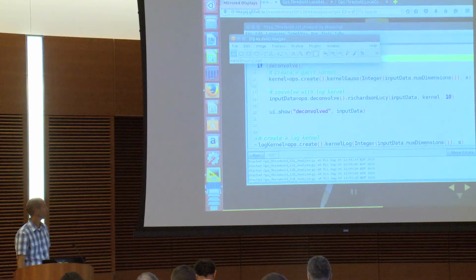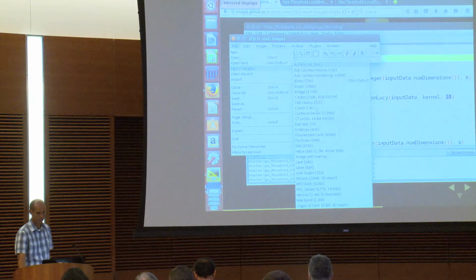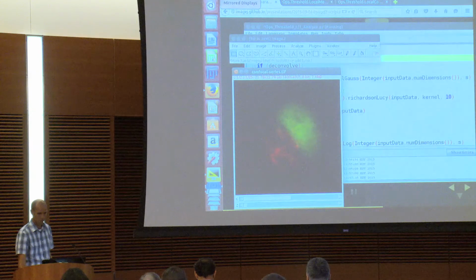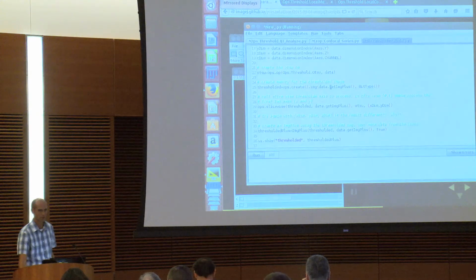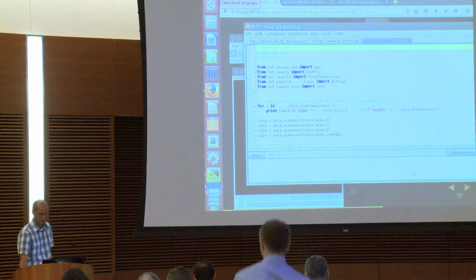Anyway, I closed all my images using Shift W, so I'm going to start a little bit cleaner. Then open samples again, and open up the confocal series image. Now, go to templates, tutorials, and this time we're going to do slice-wise threshold.